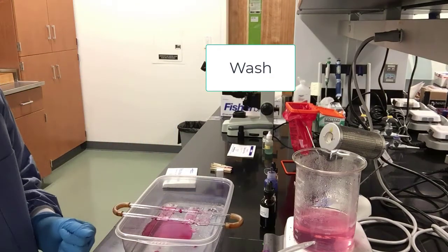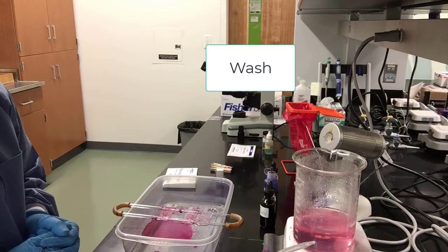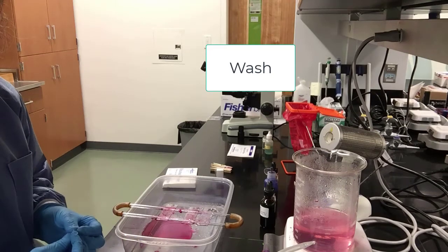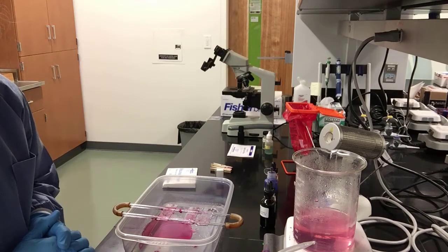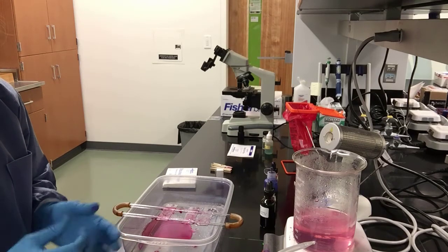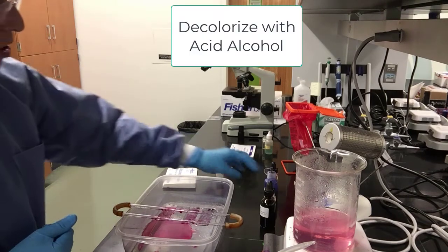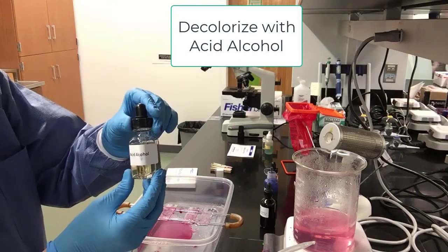The next step, according to the protocol in your lab manual, will be to add the acid alcohol. Now remember, the acid alcohol is a decolorizer. It will decolorize the cells that are not acid-fast positive. The ones that are will retain the carbolfuchsin because they have those lipids, and the carbolfuchsin will kind of mix in with the lipids.